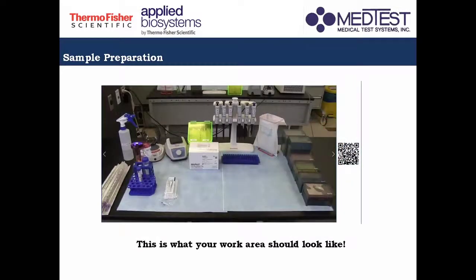So this is how your work area in your sample preparation should look like. So basically, you would want to design your work area wherein mas easily accessible lang yung mga consumables na gagamitin nyo. So this one, I guess I will be explaining this hands-on naman.